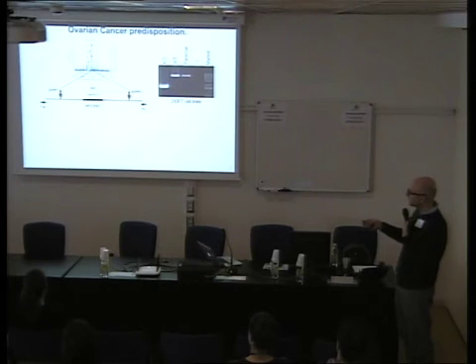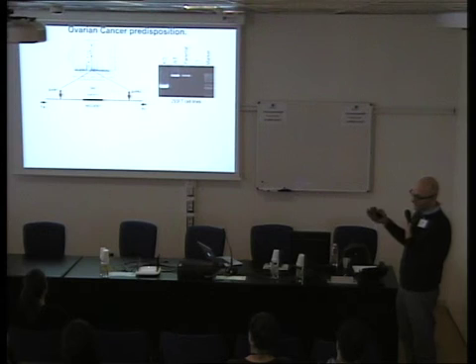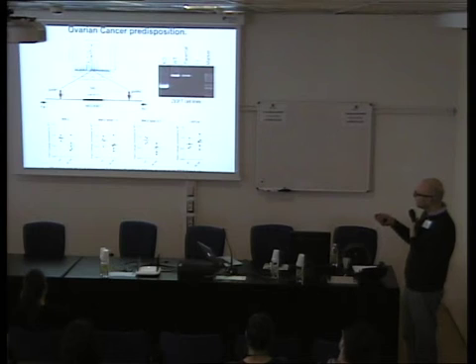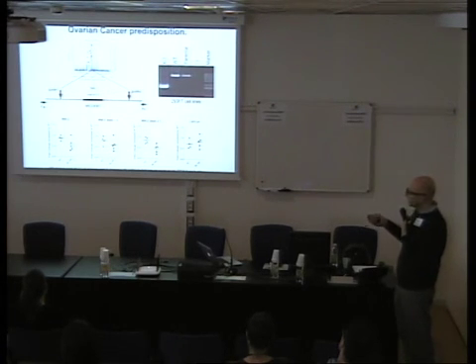here, shown in the picture, in the parental cell, you get this band that is about 5 kb. This is a wild-type clone, and this is a knockout clone when you have a band of about 1.3 kilobases. So we collected a few clones, and as a control, we used clones that here and here had errors, mistakes made by the non-homologous end joining.